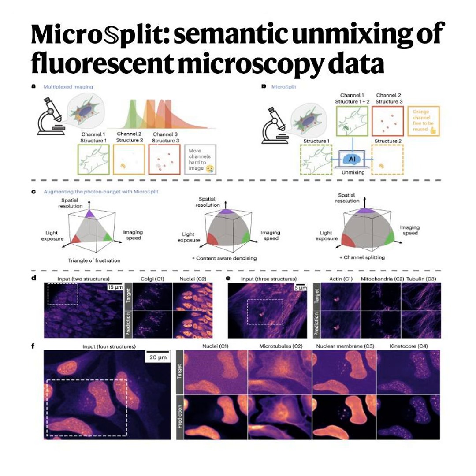That is the crucial question, and it brings us right to the algorithm's architecture. How does it resolve the overlap without making things up? Yeah, exactly. Let's get into the mechanics. The system behind MicroSplit is called a Variational Splitting Encoder-Decoder network. That is a mouthful. It is, but it's essentially a hybrid. It's the child of 2 distinct, pre-existing AI frameworks that the researchers sort of spliced together.